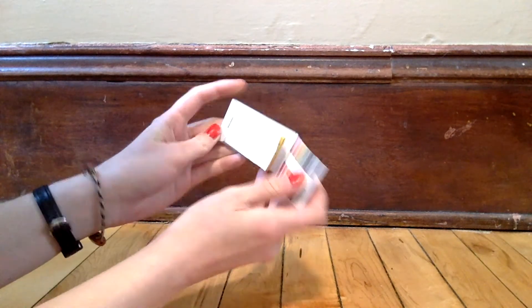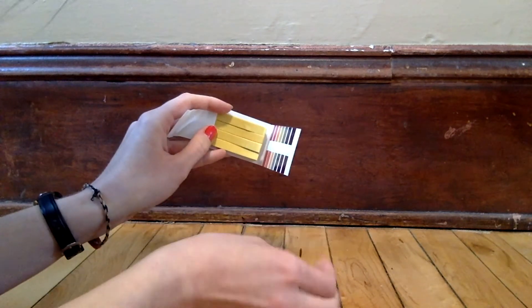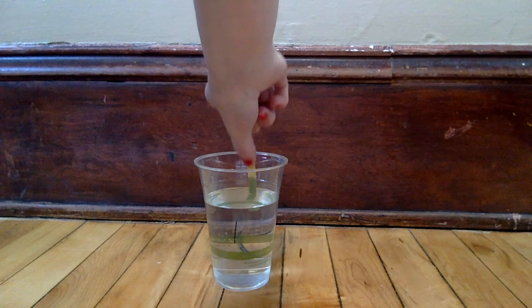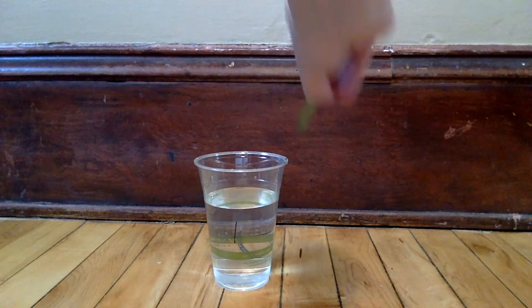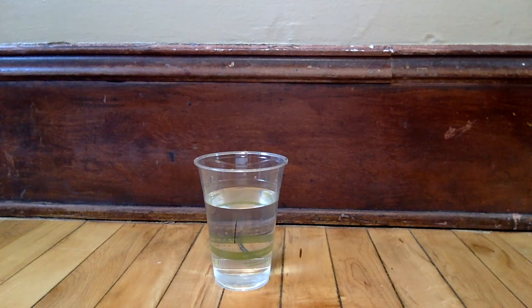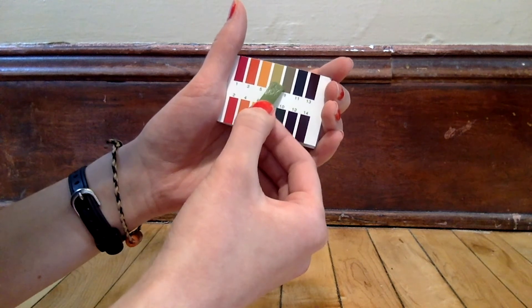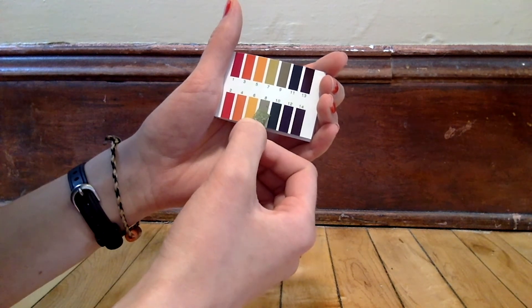Now it's time to test the pH of each of our cups. Gently tear off three pH test strips. Starting with cup number one, place the pH test strip into the cup for a few seconds. Remove the strip and wait a few seconds for the color to develop. Then, using the color comparison chart in your pH test packet, determine the pH of your solution. Write this number down on your worksheet.